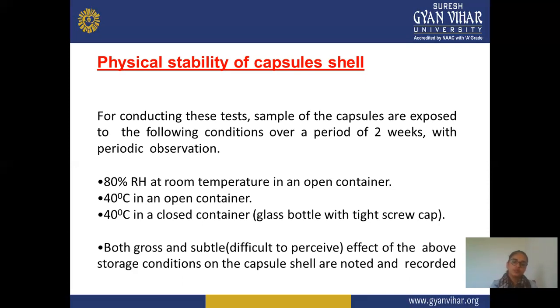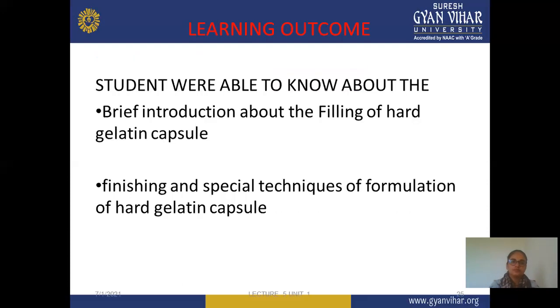The effect of the above storage conditions on the capsule shall be noted and recorded in the specific time period, to check whether changes take place or not, and whether your capsule remains in a stable form or not. These readings are recorded for the physical stability test.